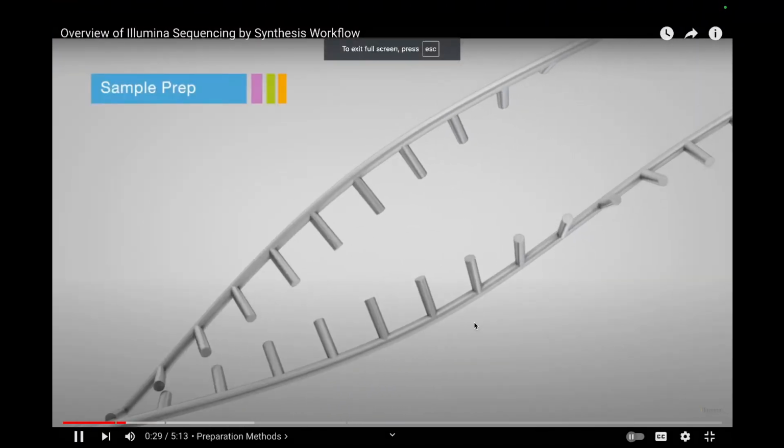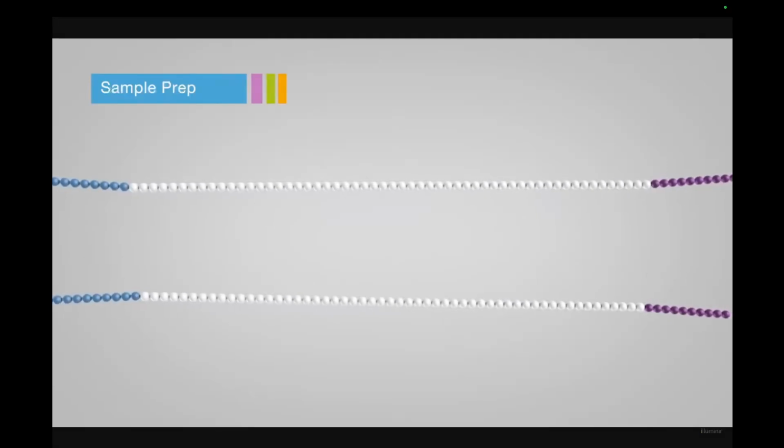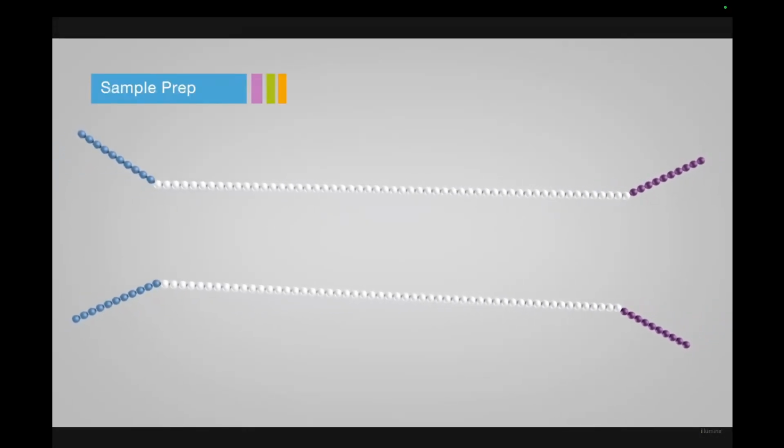ways to prepare samples. All preparation methods add adapters to the ends of the DNA fragments.